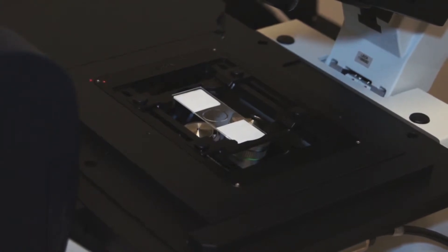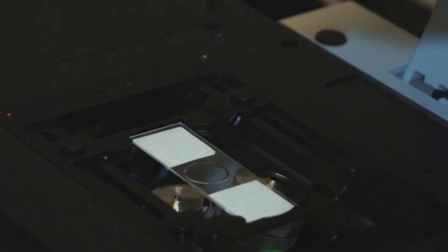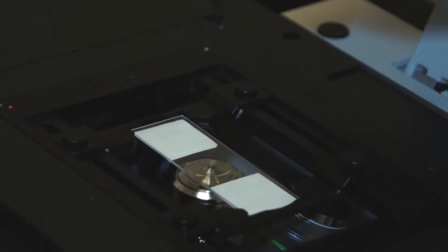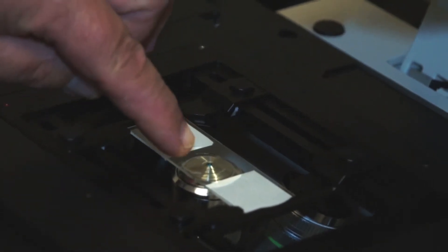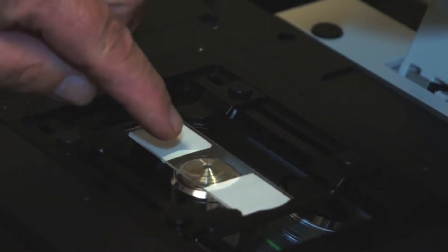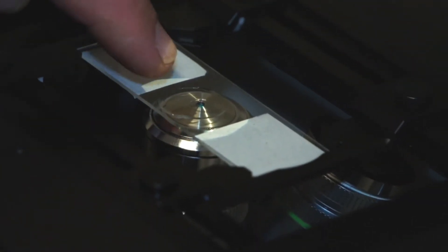We add a drop of immersion oil to the front lens of the objective — just enough oil to cover the front lens. Then we rotate the nose piece fully into the optical path. You can see now that the front of the objective is wet, touching the cover slip of the slide. This is how you use an oil immersion or glycerin immersion objective.